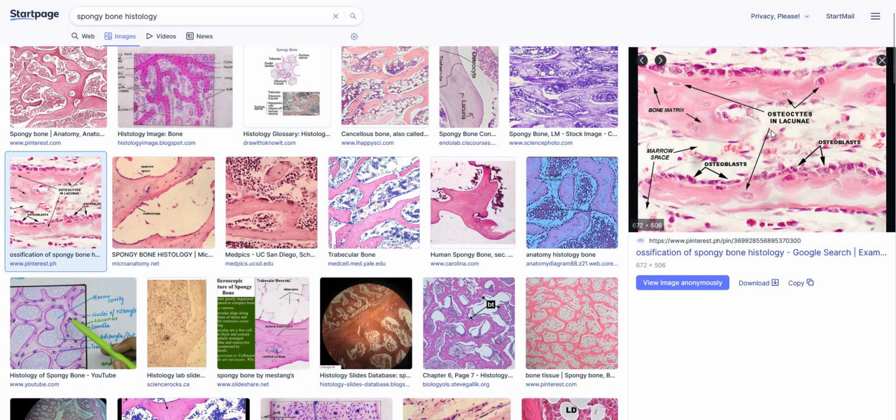And we'll look at a model that'll make this make more sense. But we can tell this is bone because we see lacunae housing osteocytes. I misspoke there. We have osteocytes when we talk about bone. So osteo means bone, cyte means cell. So we still have lacunae, but in this case we refer to bone cells as osteocytes. So that's how we can tell that this is actually the bone rather than the marrow. So we'll look at some slides like that, make sure you know how to identify it under a microscope.